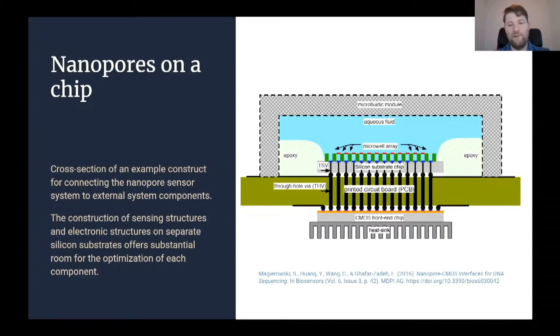One of the important parts of this setup is that they wanted to make it fairly modular, because they wanted to be able to switch out the pores separately from switching out the other components, so that they can iterate quickly and make sure that the system could evolve over time. And they mostly succeeded in that. It's actually now possible to switch out the pore protein and the chemistry somewhat separately from the rest of the system. You don't have to upgrade the entire machine if you want to upgrade the pore.